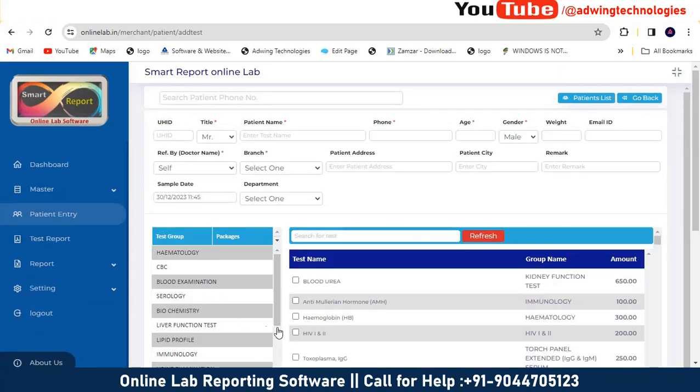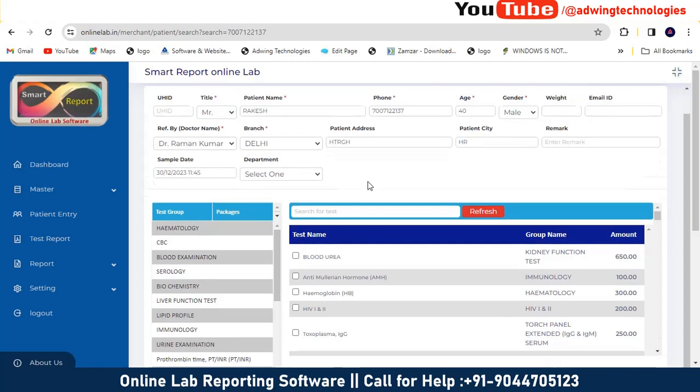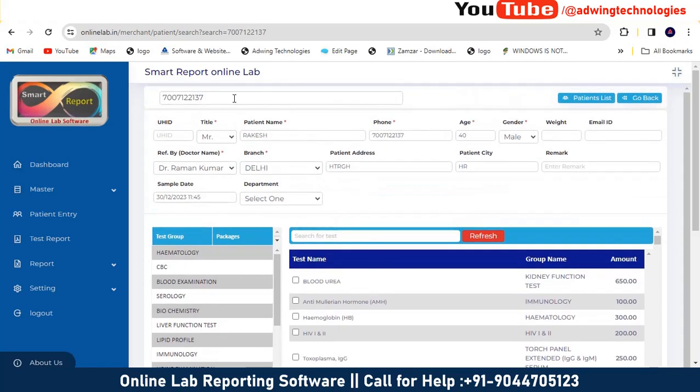Patient entry. This is the first screen where you can interact. If you have an earlier patient, just put the number and you will get all the details of the patient. So this one is not there. UHID. See, the number just entered already exists in the database and is filled by default. So that saves your time as well. Just put the mobile number, you will get all the details.